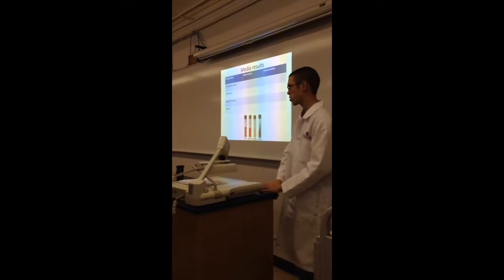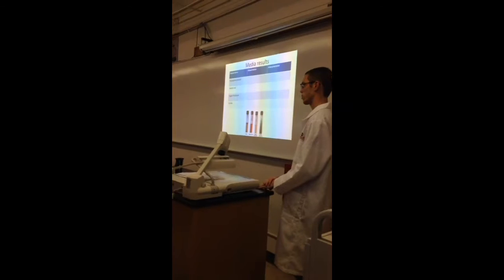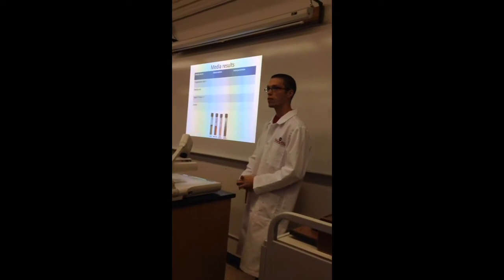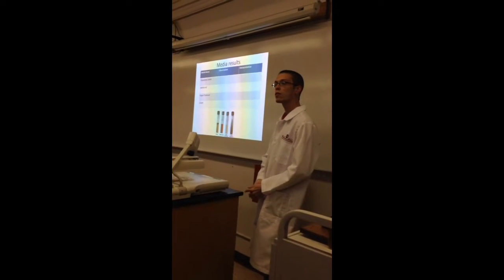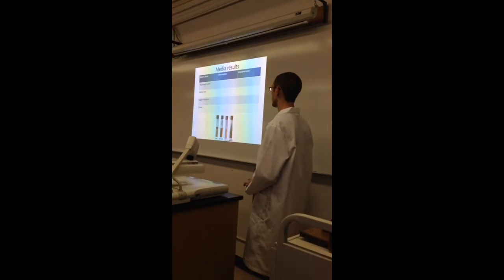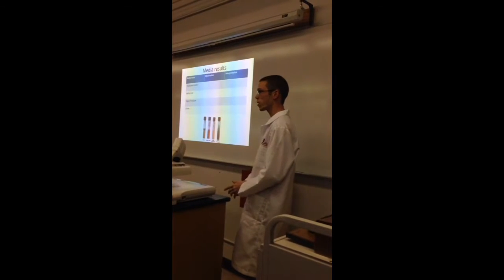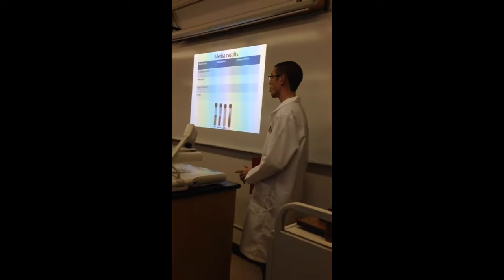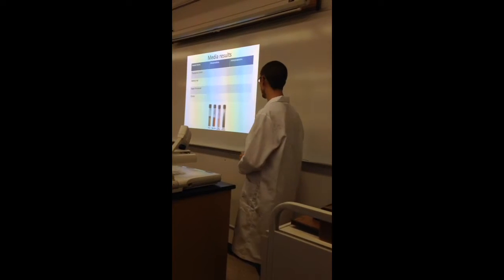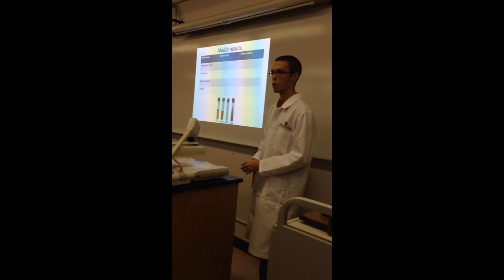So what about the interpretations? This one's a little more to it. For the tryptophan, if you have red, what does that indicate? Right, so that indicates indole production. You don't want to just say tryptophan positive. Indole positive would be okay, but you can't always just say the media and then positive or negative. You want to know what it actually represents.